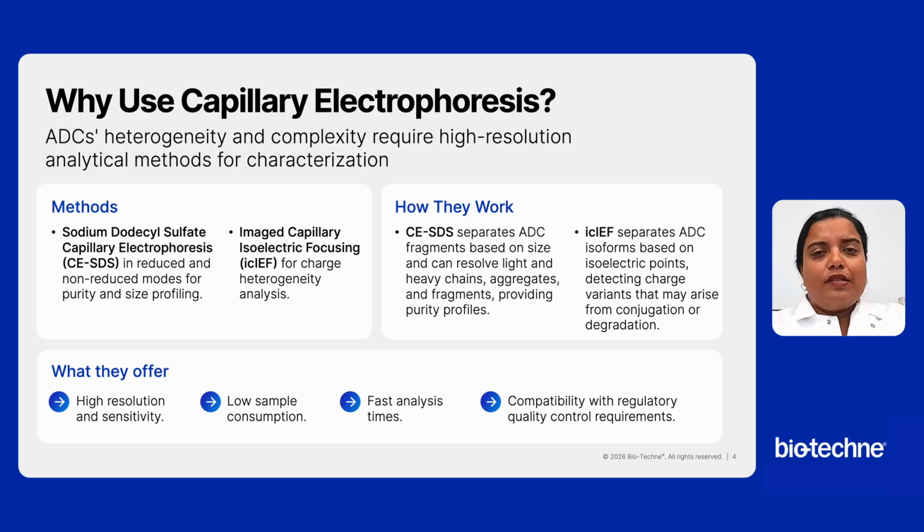Minimum sample consumption. CE requires small sample volumes, preserving valuable ADC material, especially critical during early stage development when material availability is limited. Speed and automation. CE offers quick runtime, making it suitable for high-throughput ADC characterization in research and production settings.